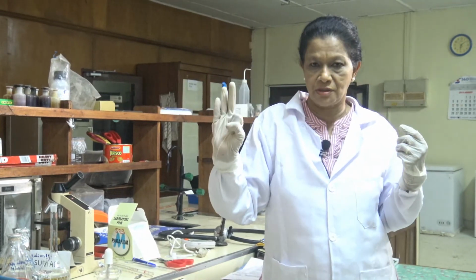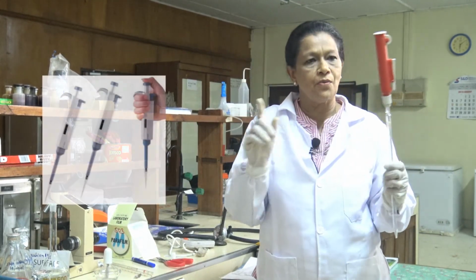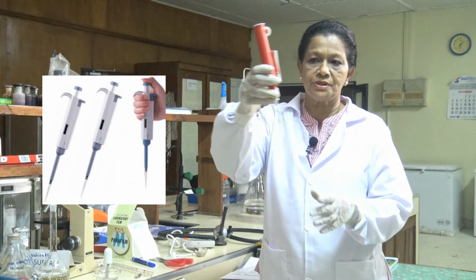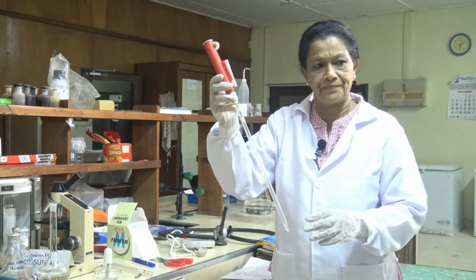Then eating, drinking or application of cosmetics is prohibited inside the laboratory. These are pipetting devices. So mouth pipetting is prohibited. You need to use the pipetting devices inside the laboratory. Do not taste or smell chemicals.